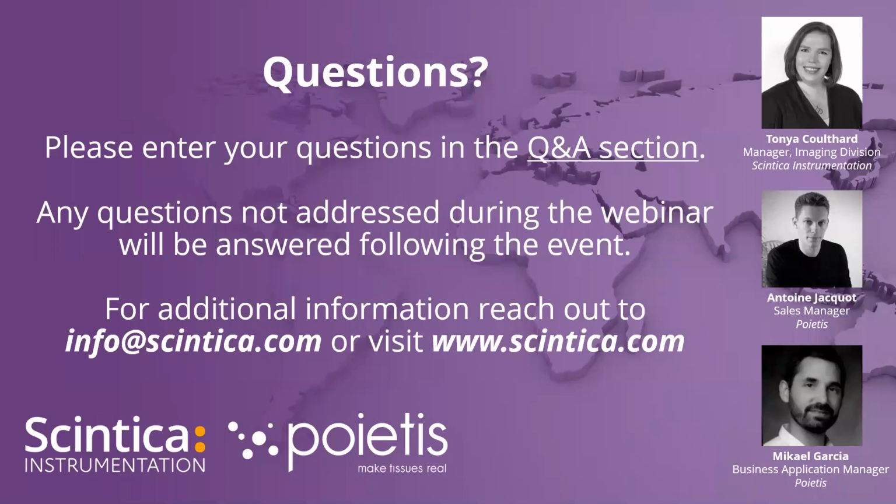So the first question that we have is, who makes the bioinks or the ribbons with the cells in them, and how difficult is it to make them, and what is really the compatibility with different cell types? And I know that Antoine touched on this a bit. I'm going to take a stab at answering this one, and then if the guys have anything that they'd like to add, I'm happy to open it up to them as well.